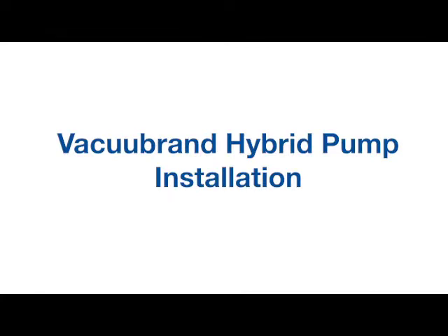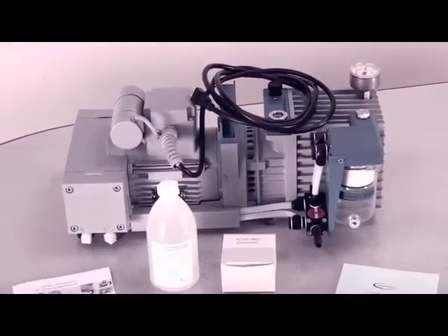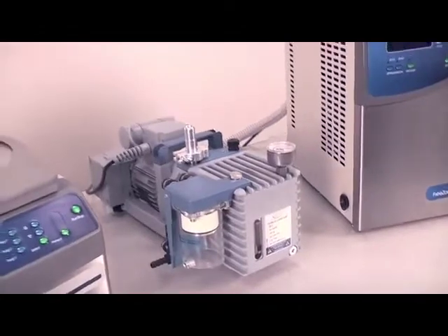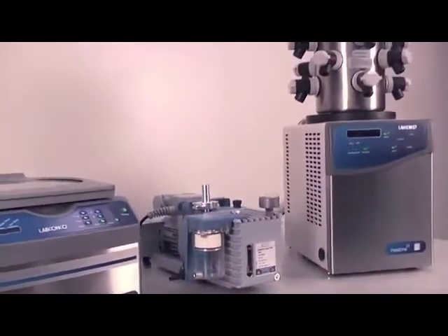LabConco's VacuBrand Hybrid Vacuum Pump is recommended for use during lyophilization or evaporation when acids or solvents are used. This video will cover installing a new combination pump.